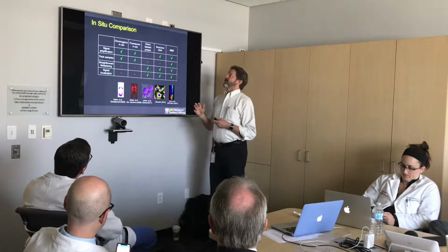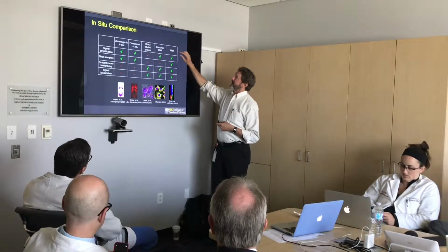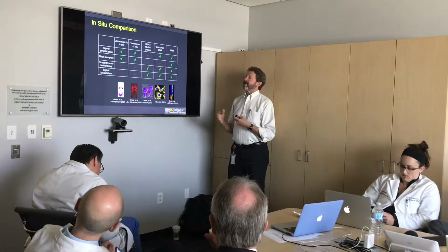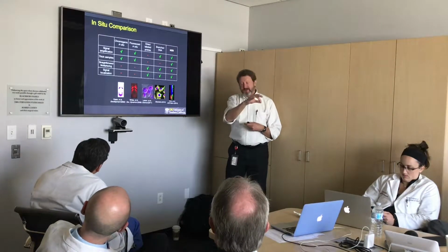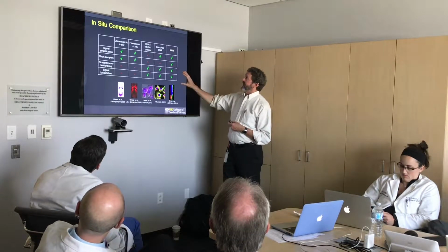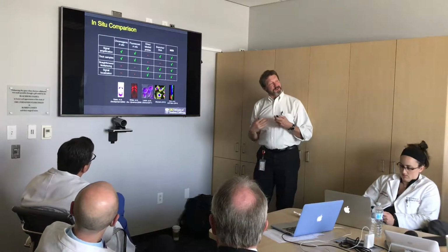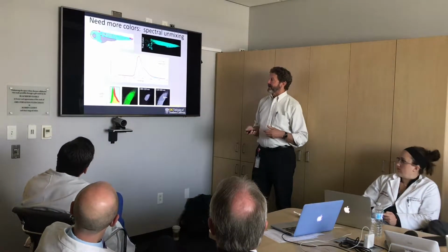There's a few other approaches that are coming out now for doing these sorts of approaches. What we like about the hybridization chain reaction approach is that it gives us the amplification. The amplification's linear with the amount of gene product that's there to about 3 to 5%. The hairpins diffuse in well, so it works well on thick samples and on biopsies and things of that sort. And the multiplexing goes way up. The other approaches work, but we think lack something. And so we're still refining it and have new versions of this coming out all the time.